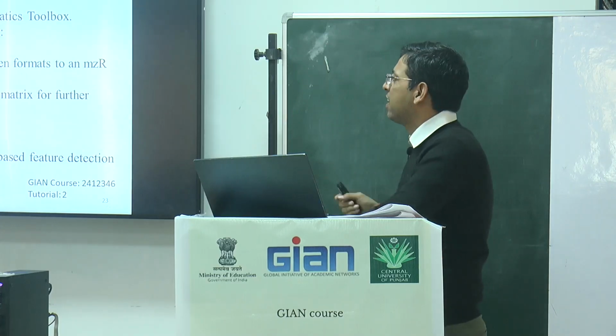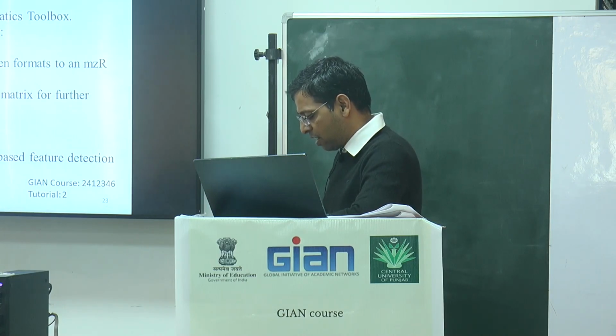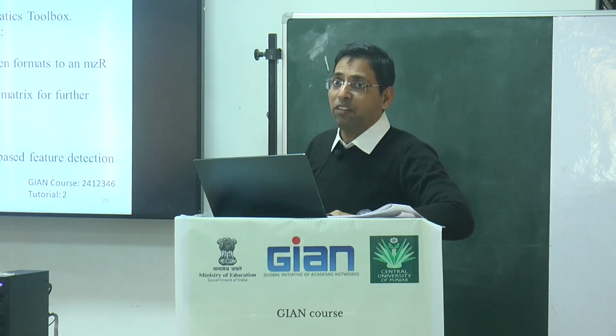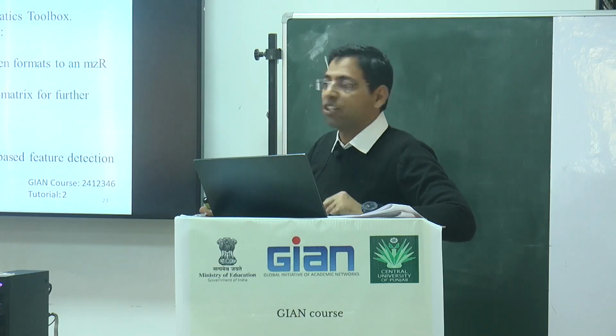So general data analysis platforms are MATLAB and R. I requested someone, he gave a lecture on R. He told me it is not possible for him right now. I am not able to do it, so, sorry. But R is very important for this type of work. If you use R, you can analyze the data easily actually.